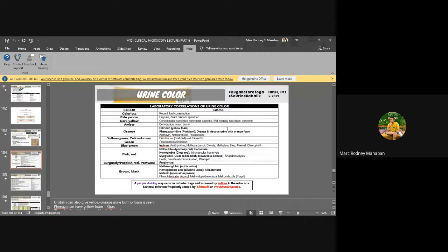Alright? Now, iyahang appearance sa urine daw kay mura siya orange. No? Orange niya viscous pagyud with orange foam. So, na-reference nag-ingon na it's similar to soda pop, orange soda pop. So, mura siya royal. Ina yung appearance. Okay? Alright, ayan. And other drugs causing orange na urine, you have acryflavine, nitrofurantoin, and phenindione. So, mga drugs for the urinary tract.